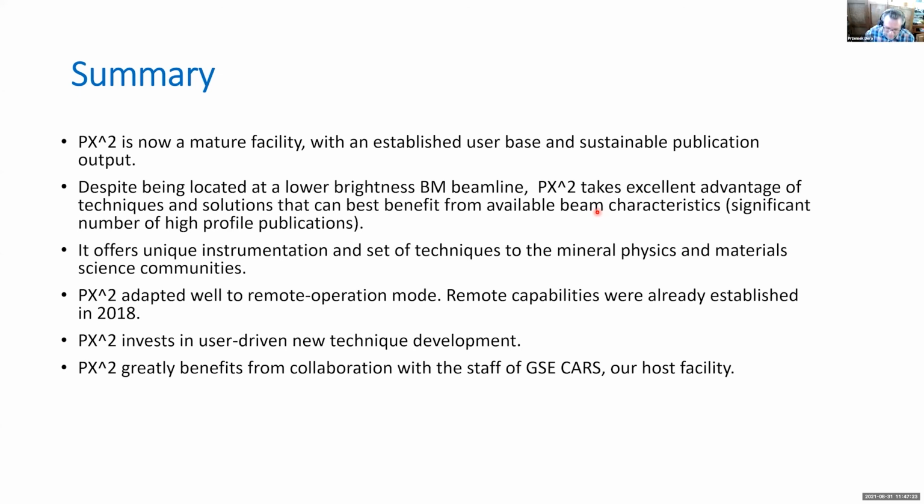Yes, thank you for the question. I think the extent of benefit for our specific instrument is going to be a little bit less pronounced than for the insertion devices, but obviously for every high pressure experiment, being able to focus the beam to a smaller size and having more photons is very advantageous. So I think with this lower emittance of the APS after the upgrade, we will have a benefit of both.